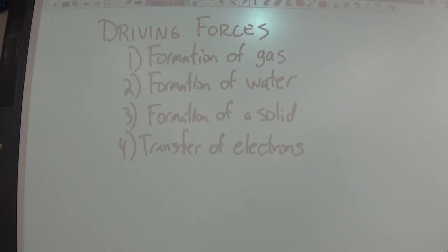I'm zoomed in a lot closer today because I want you to be able to see what's going on, and I'm going to show you some things about the lab you're going to do. But the 4 driving forces are formation of a gas. So when I mix 2 things together, if it makes bubbles, that's going to be both visible evidence, and it is what's causing that reaction to take place.